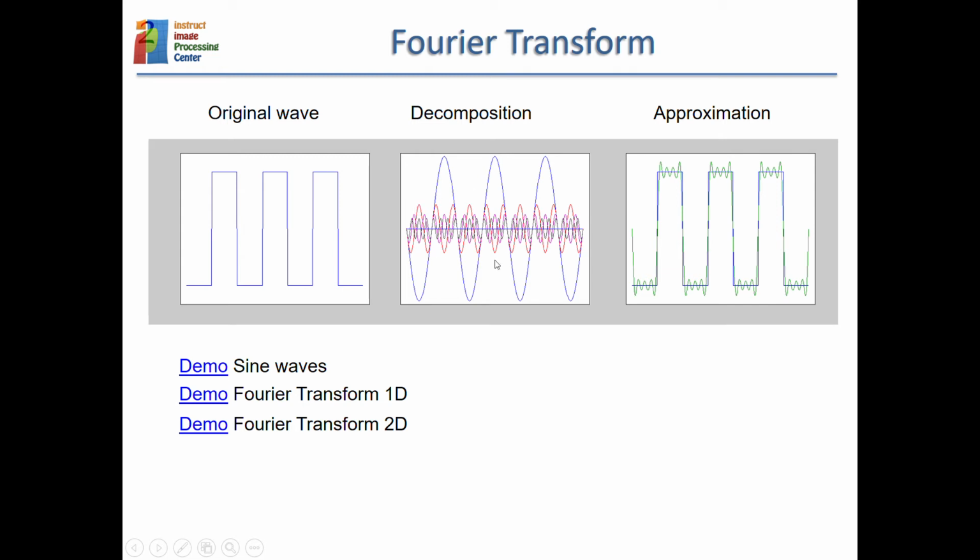And by adding all those waves, all of them with the right period, the right amplitude, and the right phase, and the phase is just moving these waves to the left or to the right, then we will be able to approximate the input image to an arbitrarily good accuracy as we like, except again there are always many details, and for instance discontinuities cannot be well approximated and so on. But as long as you have an original digital image, by adding these waves you can have an exact reconstruction of the input image.